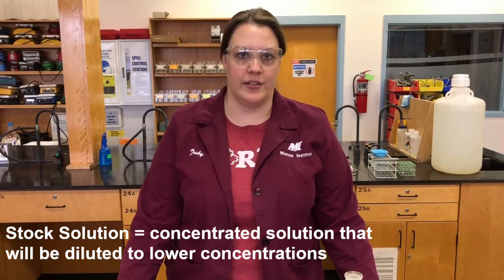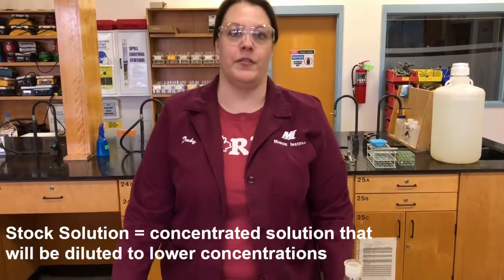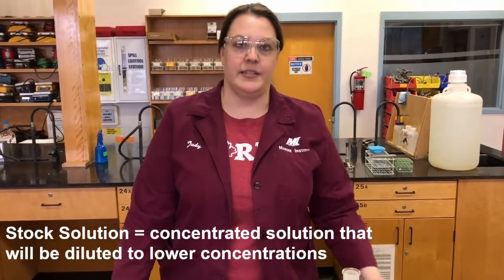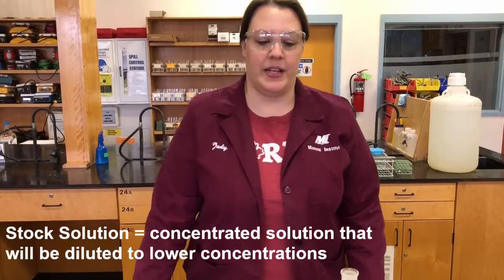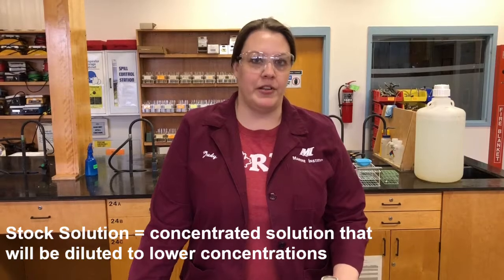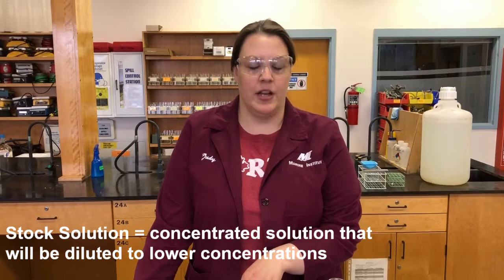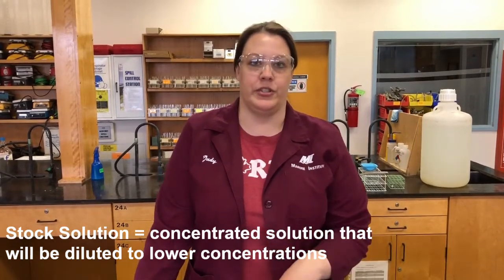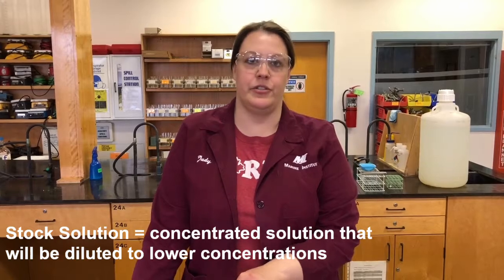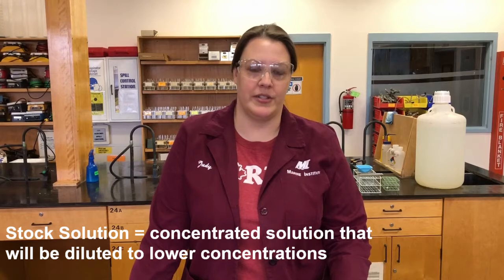So we're going to start with making up a stock solution. The stock solution is the solution of the highest concentration that we make up from the powdered form or the solid form of the substance, and then we dilute that down, okay? Because if we think about making up solutions that have very low concentrations, it would be very difficult for us to measure out very, very small amounts of a powdered substance. So the series of dilutions allows us to take a more concentrated solution and then dilute it down to get accurate concentrations. So that's the reason why we use standard solutions.